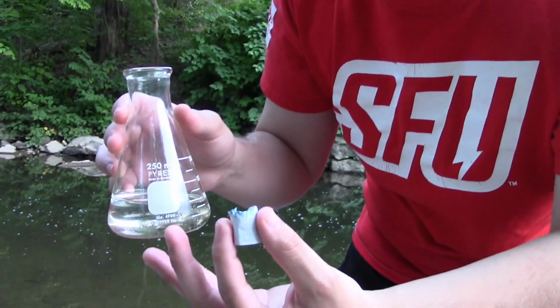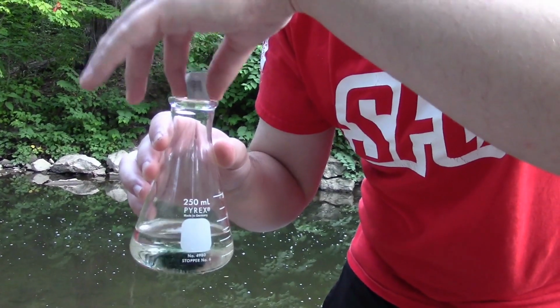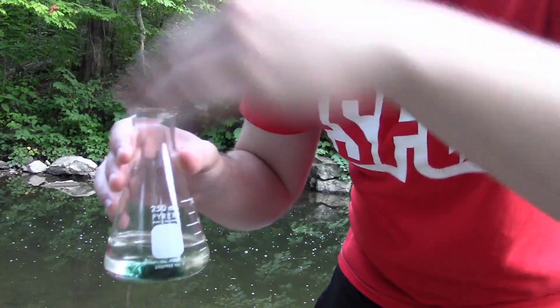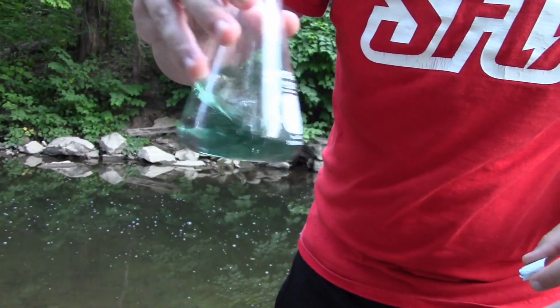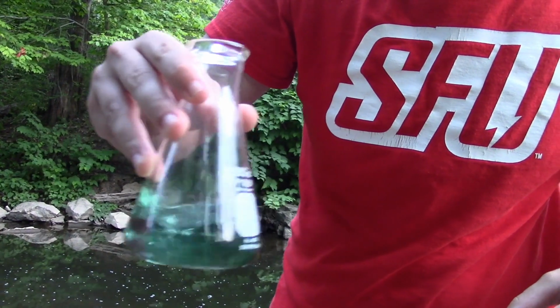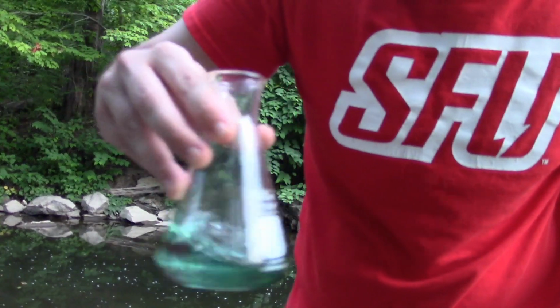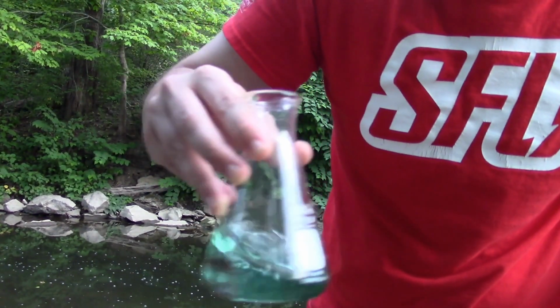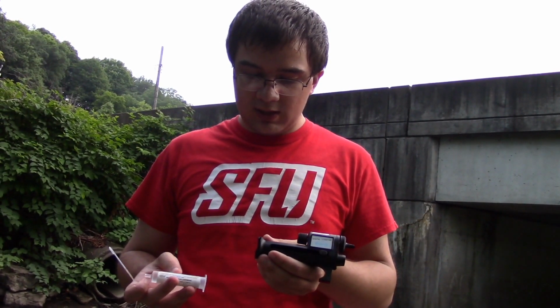Alright, the next thing we're going to do is add in our indicator into our 100 milliliter sample. And now once we've got that all in there, we're just going to mix this around until this is an even green all the way through. I'm going to give that a second more there. Alright, so now what we're going to do is set up our digital titrator.